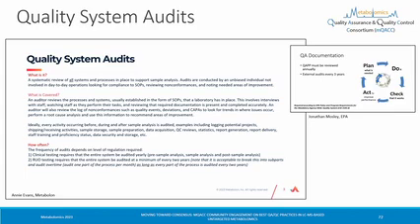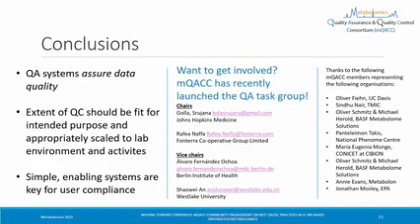Finally, quality system audits. In the EPA, John has a nice kind of system here of plan what's needed, do it, check that it works, act, and this cycle goes around in terms of following their QA documentation, planning it, reviewing it. They're doing external audits every 3 years. I think at Metabolon, somewhat substantially more often, but for different purposes. So again, auditing a very large or very regulated organization becomes a specific challenge that looks very different from the common academic lab. Okay, so that's a quick spin through QA.